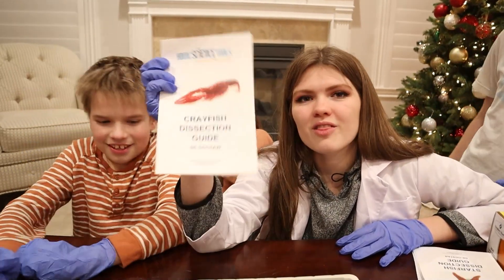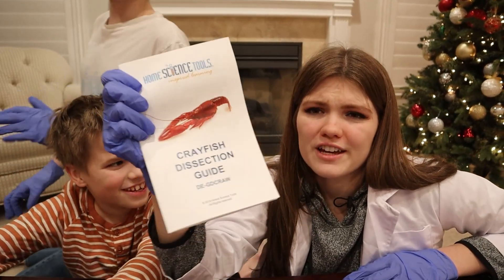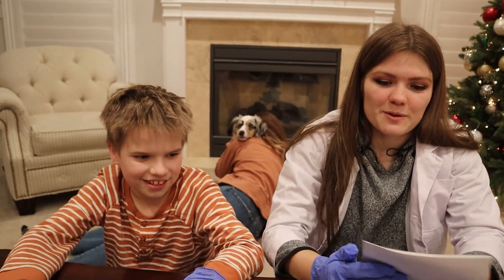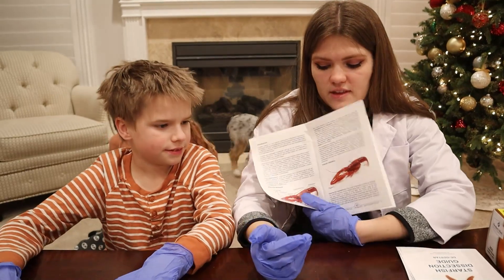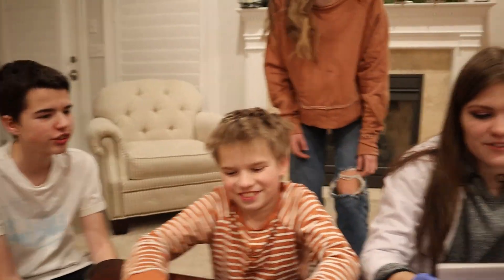And today we are going to be dissecting a lobster — actually, a crayfish, a crawfish. Jake is probably the most queasy at this. I've never dissected this, so good thing we have a diagram. We're not dissecting the frog.